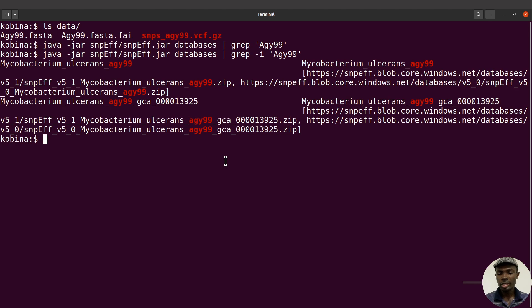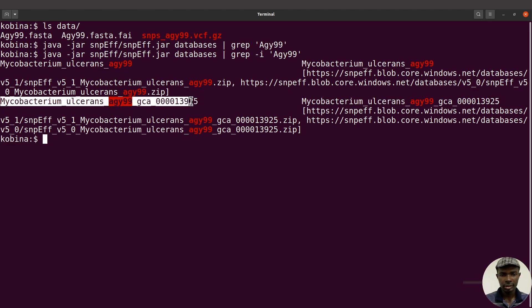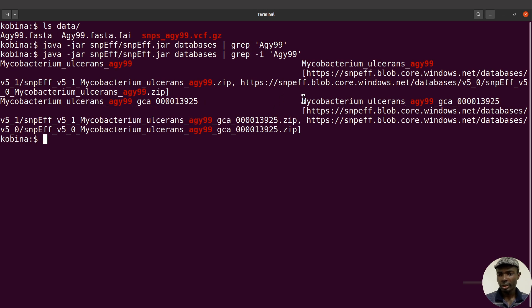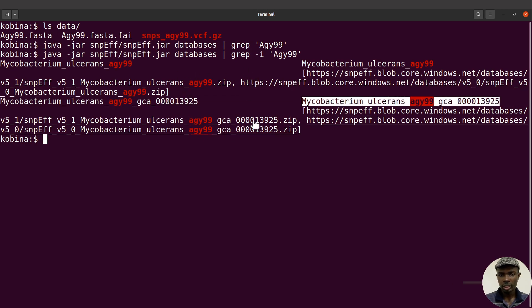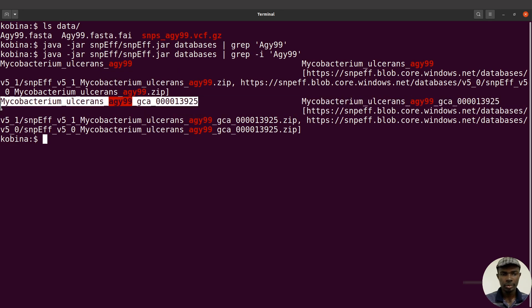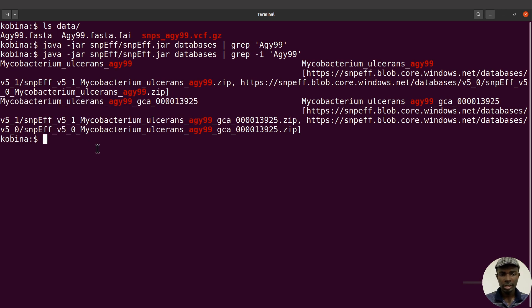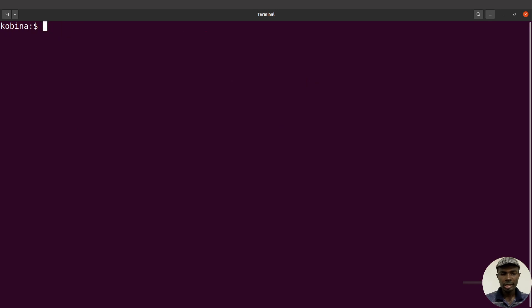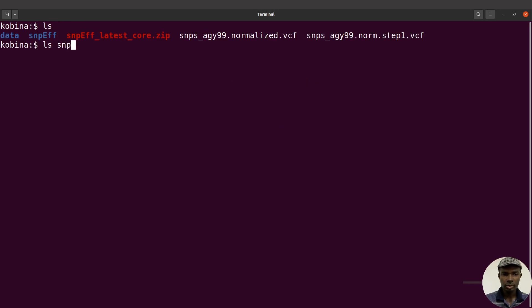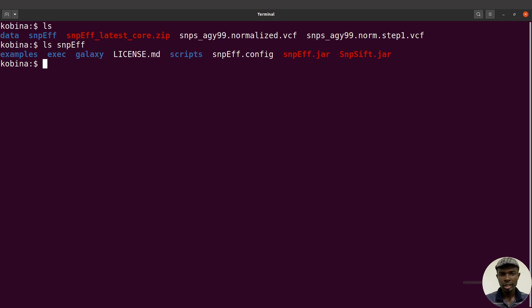What we are going to do next is download the database for our reference sequence, AGY99. You can see the name of the database here — that's what we'll use. I'll copy this name because I'll use it later on. Now I'm going to download the database. Let's clear the screen, let's ls into snpEff — we have our snpEff directory here.